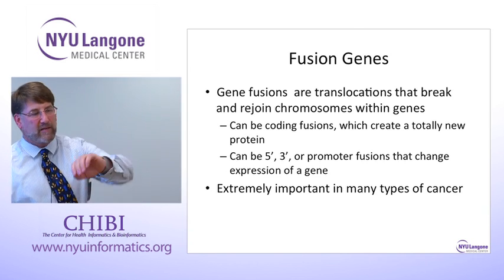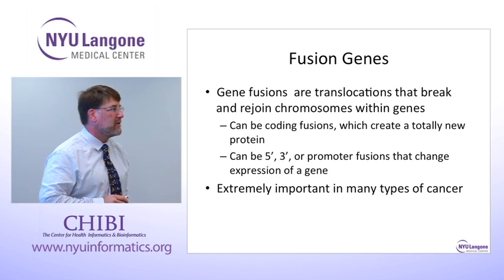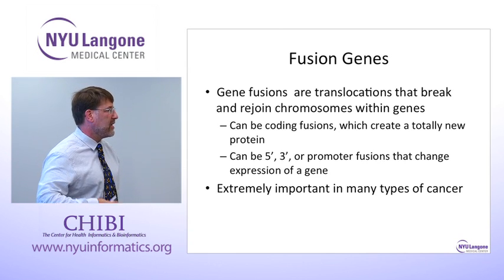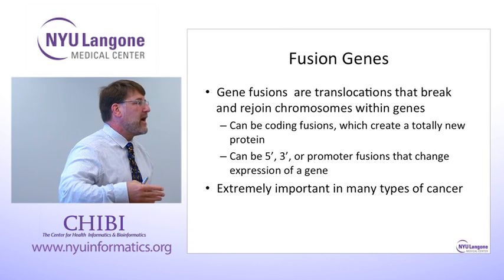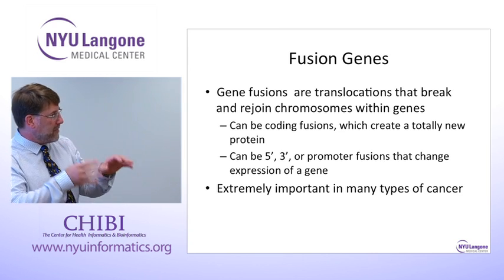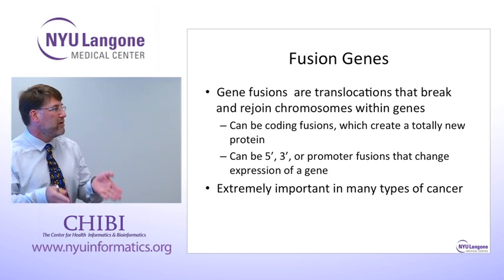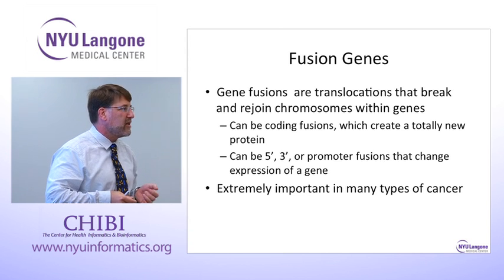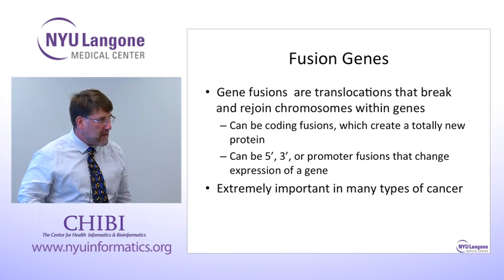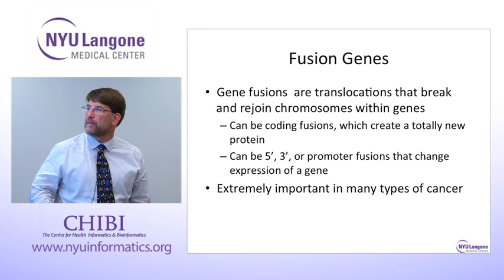OK, last major topic that I wanted to hit on, because we've had success with this in the last couple of months, and it's really exciting, is this idea of fusion genes. Fusion genes are really important in cancer. They are dominant mutations. So when a chromosome breaks and reforms at a position where a transcript exists, you could create a brand new transcript with a new gene function, which could be an oncogene. So we're looking in all kinds of cancer samples at RNA-seq to try and predict fusion genes.